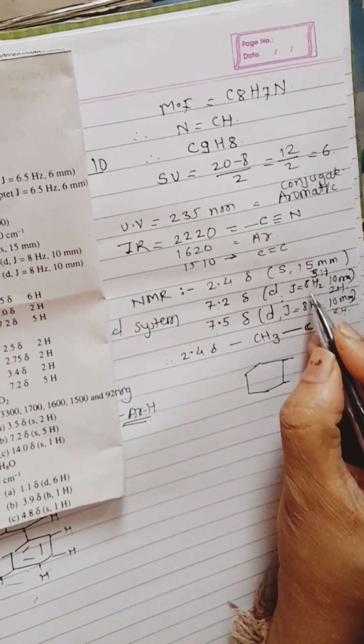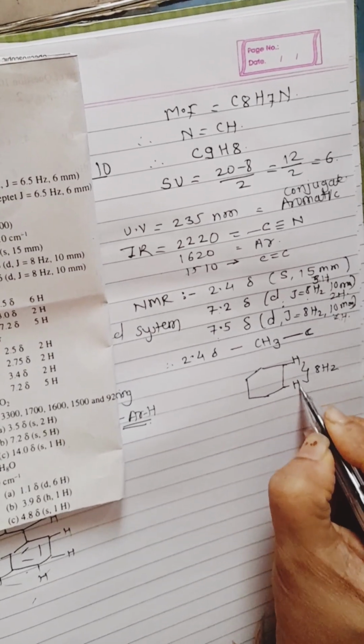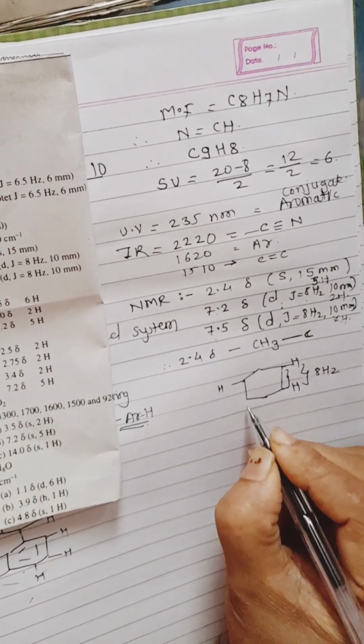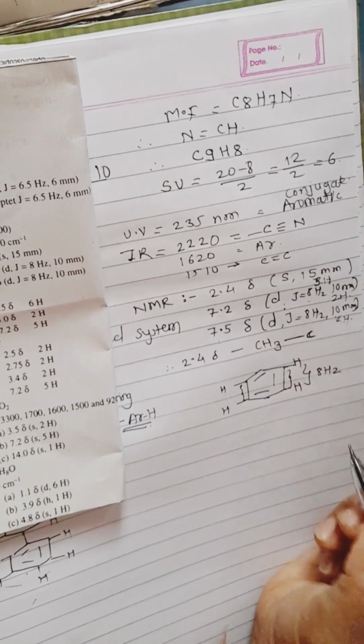Of course the coupling constant is 8 Hertz, and therefore those aromatic protons are ortho to each other, and this is clear from the coupling constant.